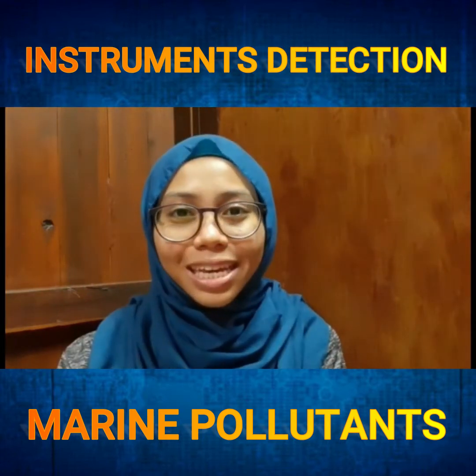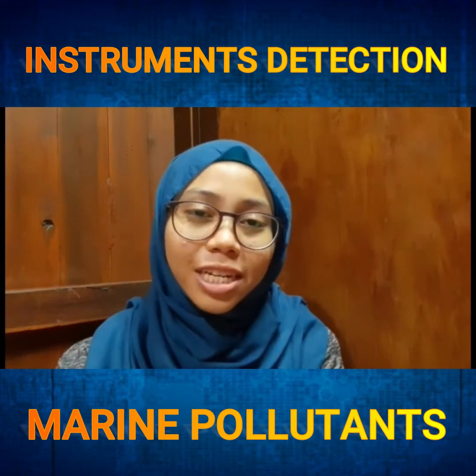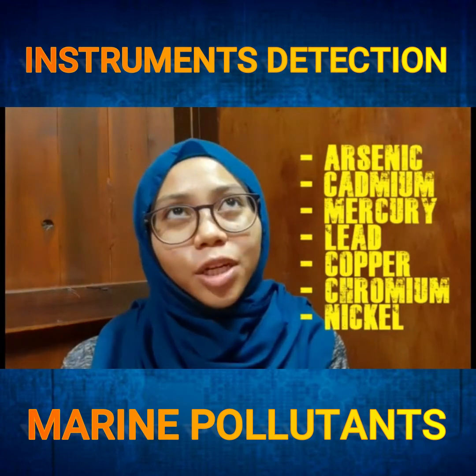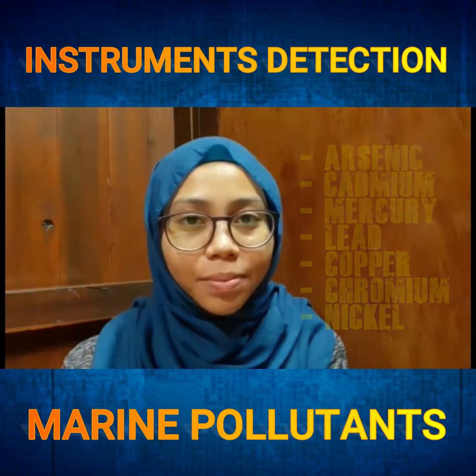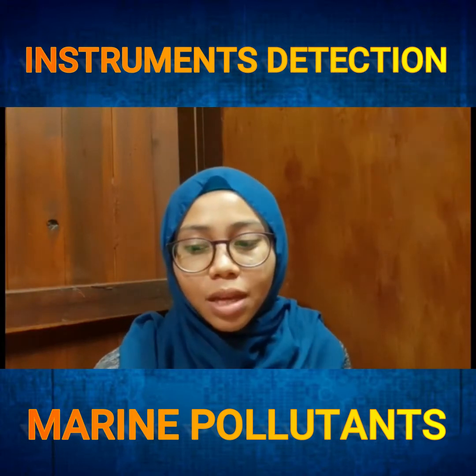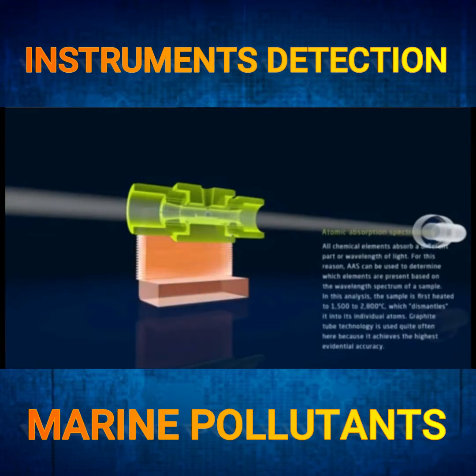So GFAAS has been used primarily for analysis of low concentrations of metals in water samples such as arsenic, cadmium, mercury, lead, copper, chromium, and nickel. So what is the basic principle of this instrument? You can see here it utilizes the principle that elements in the gas phase absorb light at very specific wavelengths, which gives the technique excellent specificity and detection limits.